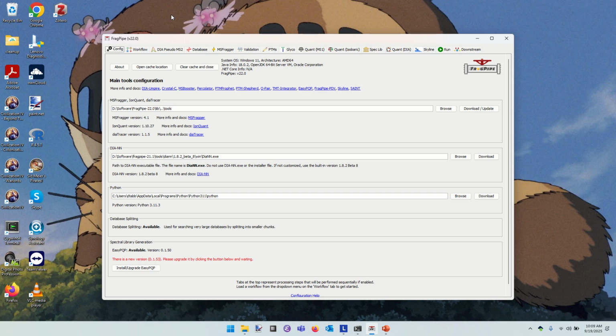After that, we're going to poke into a website called FragPipe Analyst that will do statistical testing to say what actually changed between these cohorts. And then we'll repeat this process, except this time with a mode of mass spectrometry that's much better at quantifying everything. That's the promise, at least, of DIA. So we'll talk about those differences as we move along, but I didn't want people to be taken from 0 to 60 and assume that you know all the steps in between.